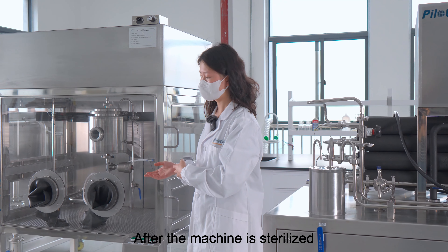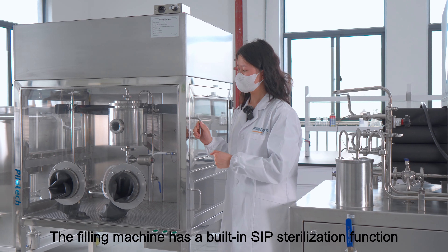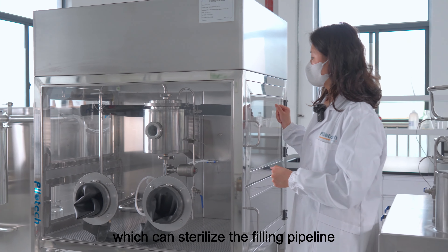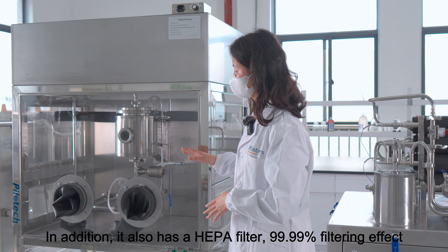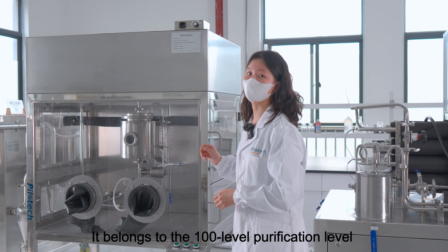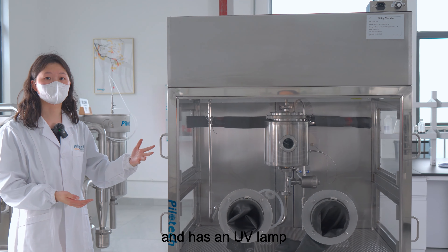After the machine has sterilized, you can choose our filling machine for filling. The filling machine has a built-in SIP sterilization function, which can sterilize the filling pipeline. In addition, it also has a HEPA filter with 99.99% filtering effect. It belongs to the 100-level purification level and has a UV lamp.